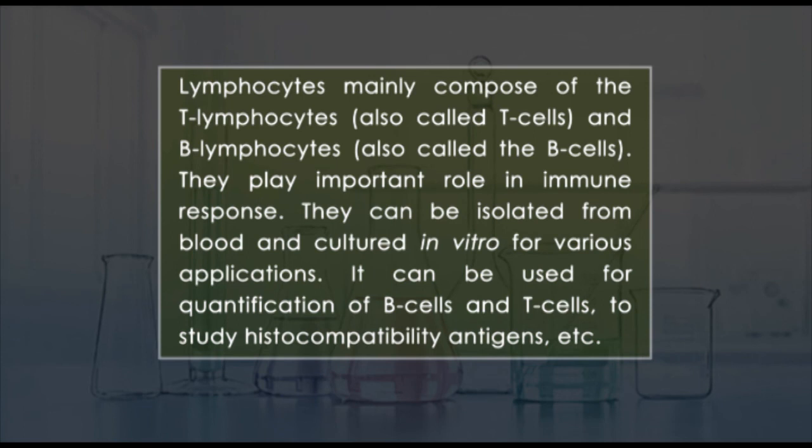They play an important role in immune response. They can be isolated from blood and cultured in vitro for various applications. It can be used for quantification of B cells and T cells, to study histocompatibility antigens, etc.